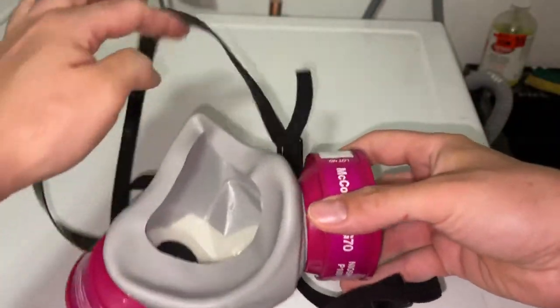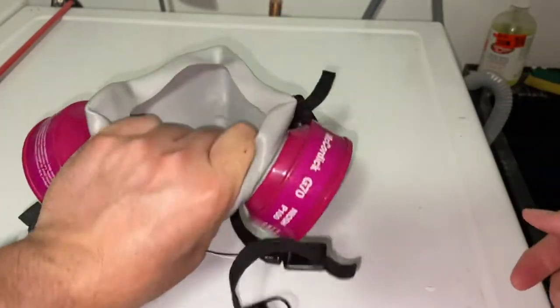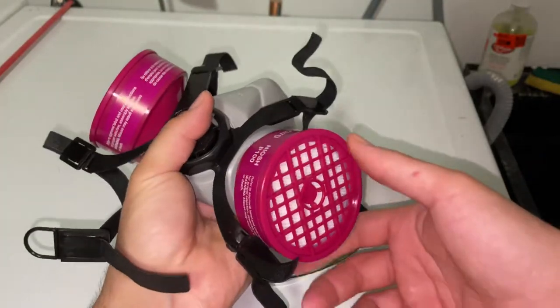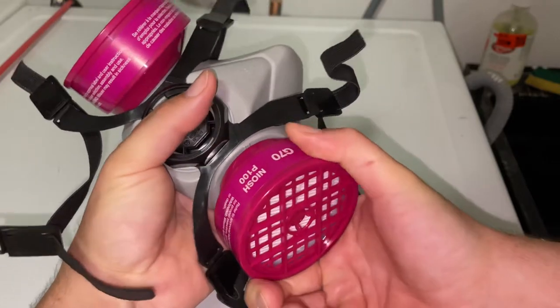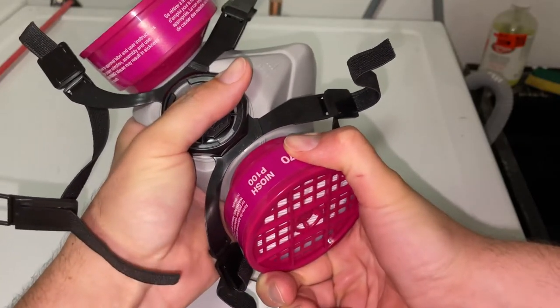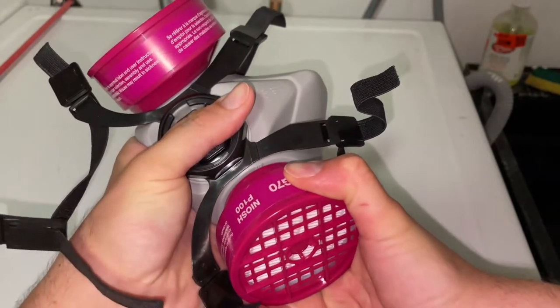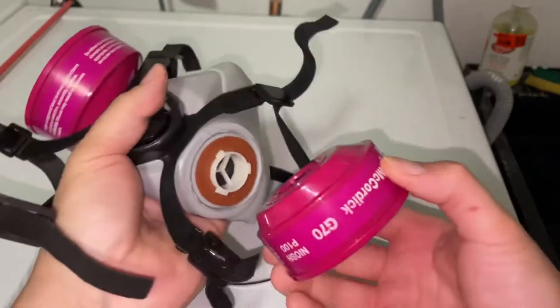So first thing I like to do is put my hand inside the mask and grab the outside with my thumb, make a nice tight closed fist and hold the frame of the mask with it. Then you're going to use your other hand and grip the cartridge, twist it counterclockwise. You will need to use quite a bit of force on some of these masks, don't worry about breaking it. Twist it, just like that, and it'll come off.